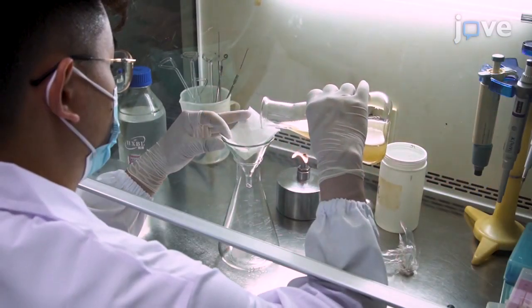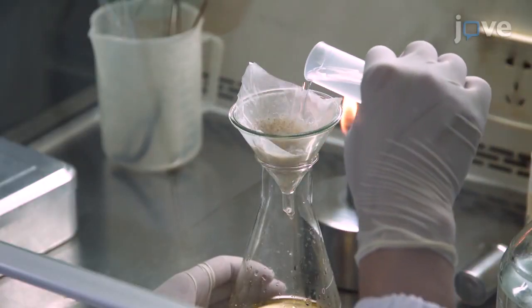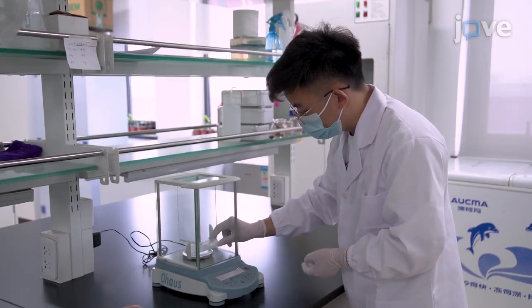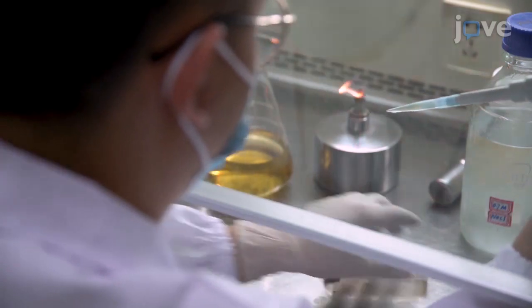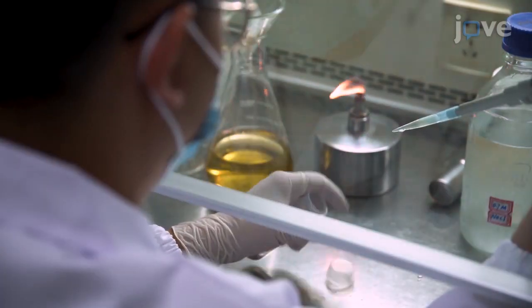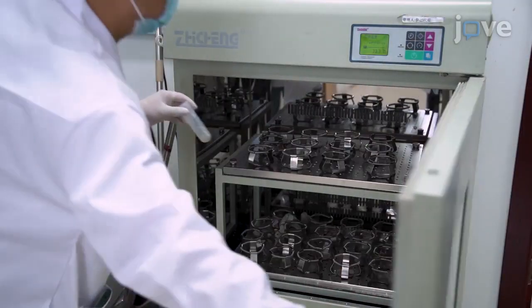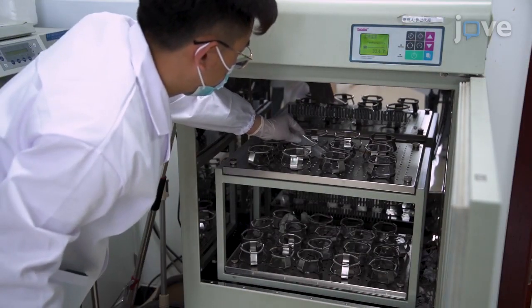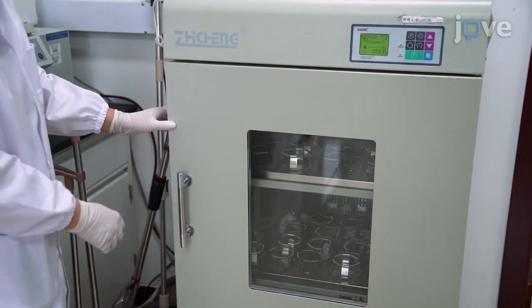Wash the fungal hyphae with 500 milliliters of 0.7 molar sodium chloride solution, then collect the fungal mycelium and weigh it. Add approximately 1 milliliter of lysis enzyme permeation solution per 1 gram of the fungal mycelium. Place the hyphae for lysing at 28 degrees Celsius for 3 to 4 hours with shaking at 150 rpm.